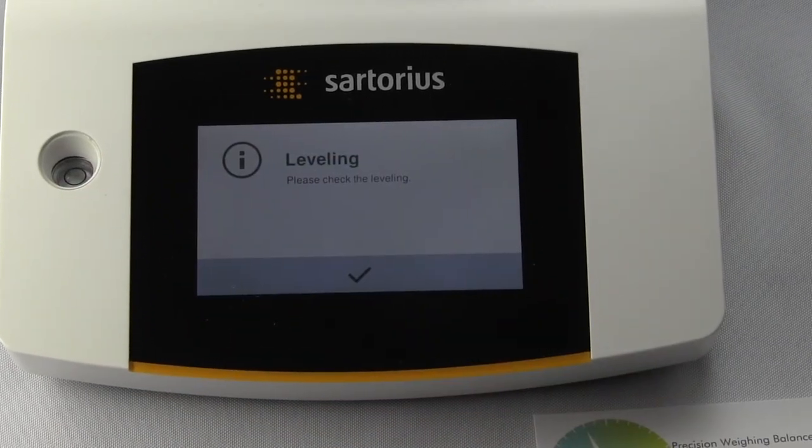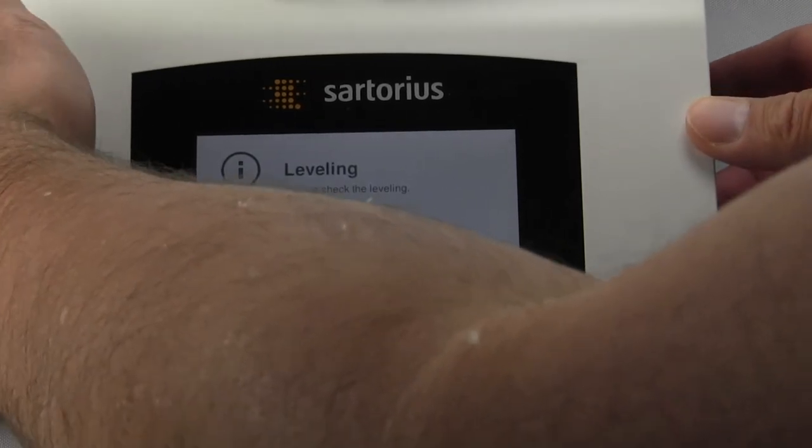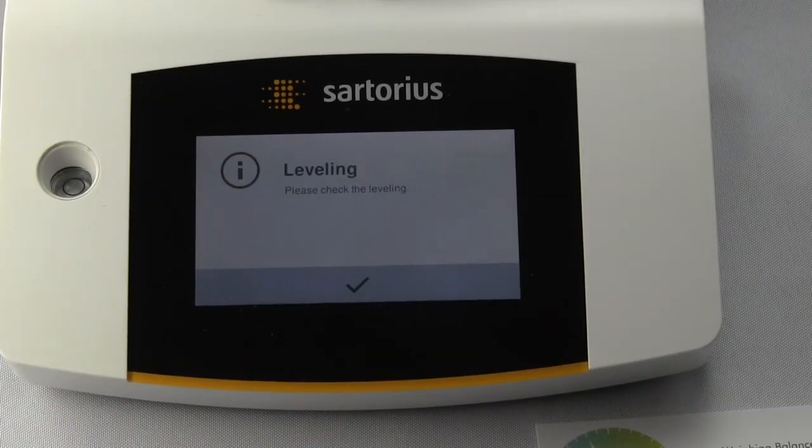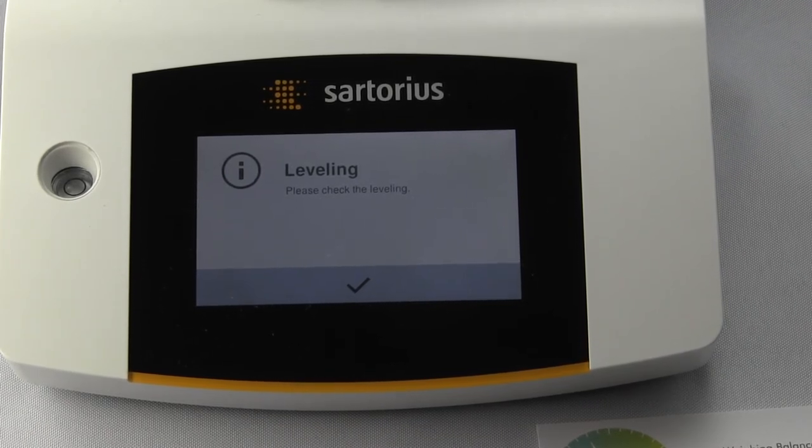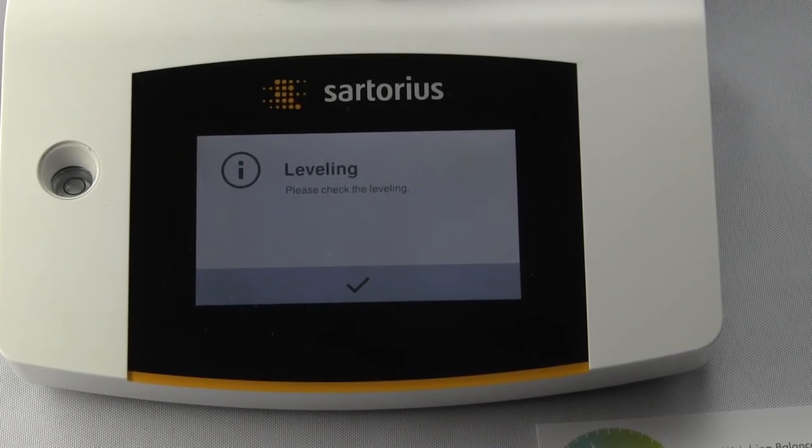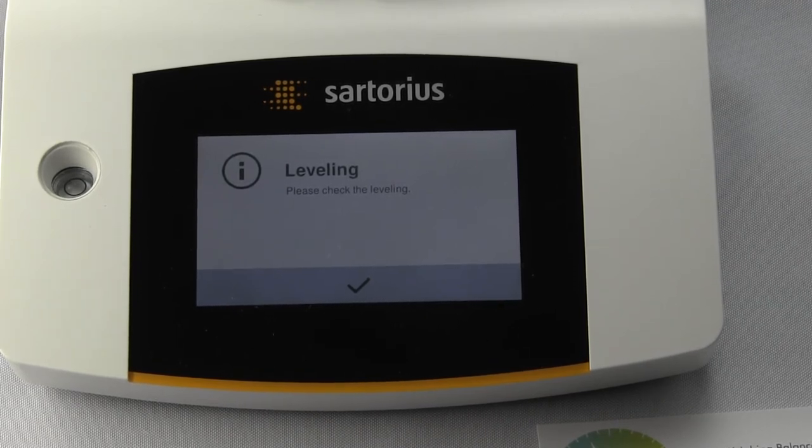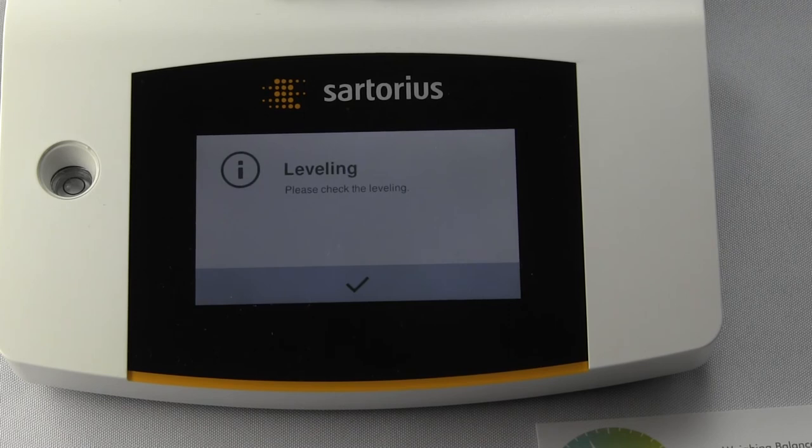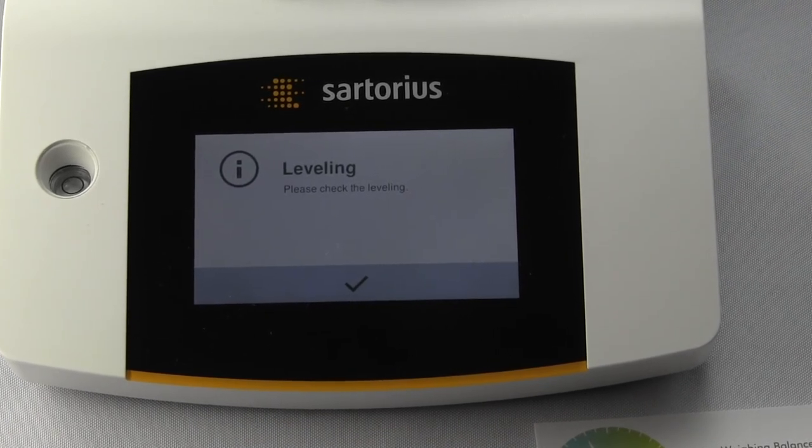The first thing it's going to ask you is to level the balance. We have a spirit bubble indicator here in the left hand corner. You adjust your two leveling feet. It's always important to attain precise weighing results that your bubble is right in the center so your balance is level. These adjustable feet compensate for any uneven bench space.